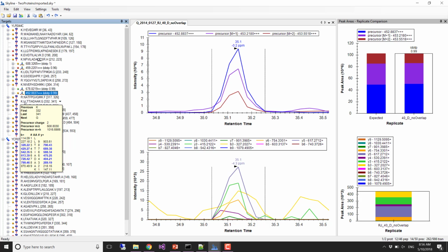But my machine can have variable windows, like 6 to 19, so we can change that here as well to make it variable. Yeah, you can have variable windows, and that's always an option. We haven't done a whole lot of that with the Thermo Q Exactive. I think our lab is still doing fixed width, but we do overlapping to get narrower windows, and Mike will talk about that.